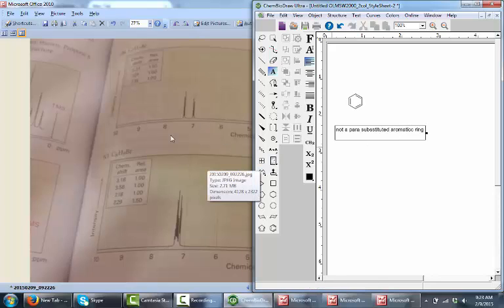And let's see, if I have 9 protons in the molecule, and I have 1, 1, 1, and then 1.5, let's put this as 2H, 2H, 2H, 3H. Is that going to work? Yep, so that's going to give me 9. Okay, so that's good.